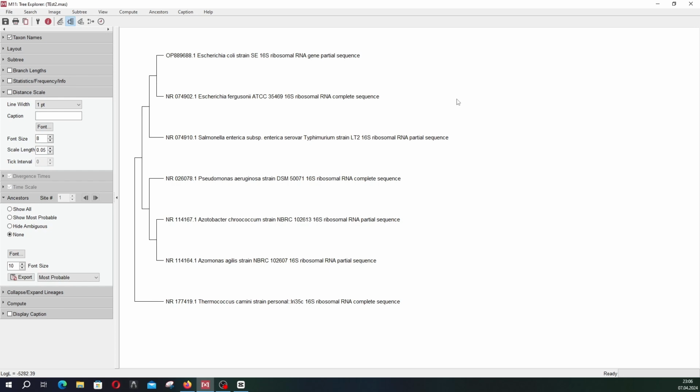Thermococcus stands out because it is a species from the superkingdom of Archaea, so it is not even a species of bacteria. It is important to check your results for plausibility after you have computed them through algorithmic methods.